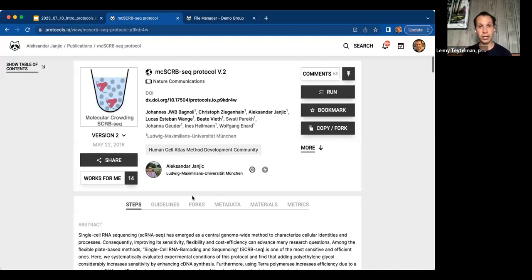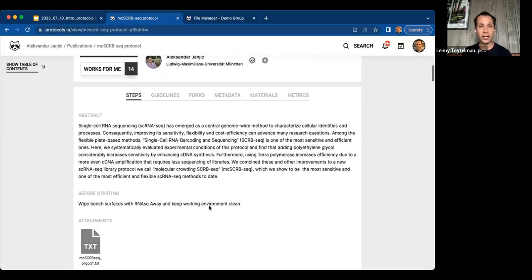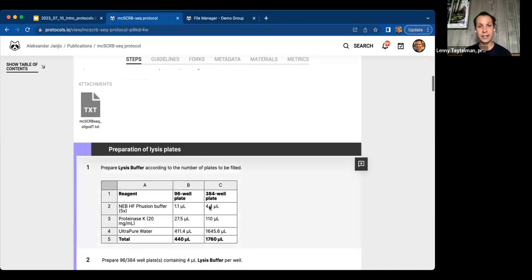You decide if you want to make it public. That's a very explicit action, and there's a publishing flow, but by default, everything is private and yours, and you're in control of how and when you share it. And in terms of the functionality, what I want to highlight is that these are not static, fixed PDFs. It's not a published paper done and fixed. These are dynamic and interactive.